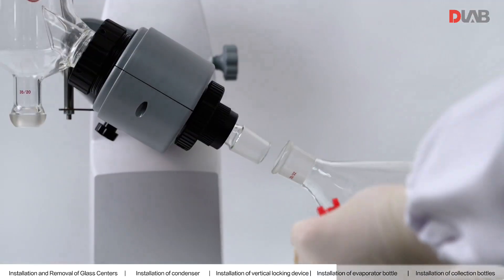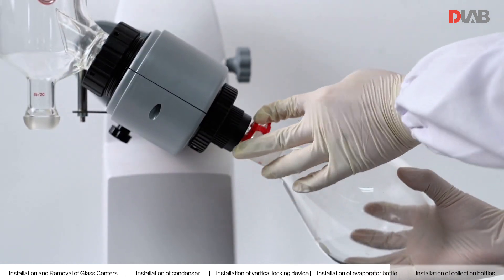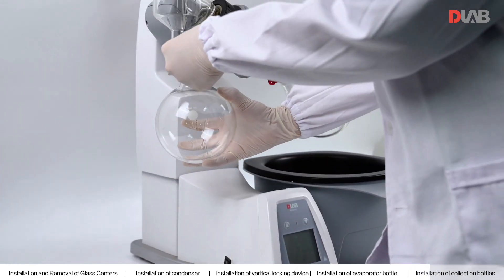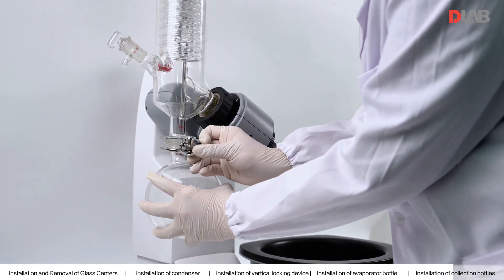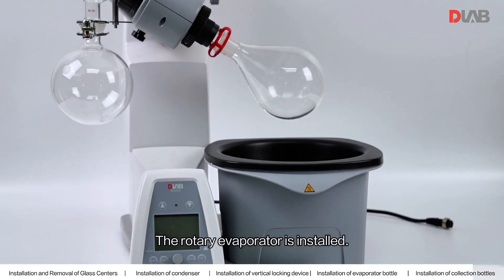Install the evaporator bottle. Complete the final installation of the collection bottle and lock the clamps. The rotary evaporator is now fully installed.